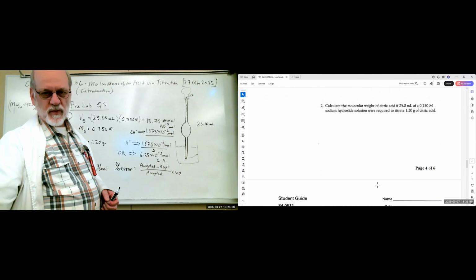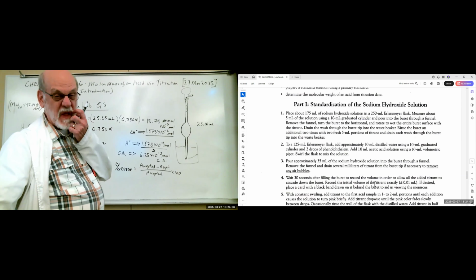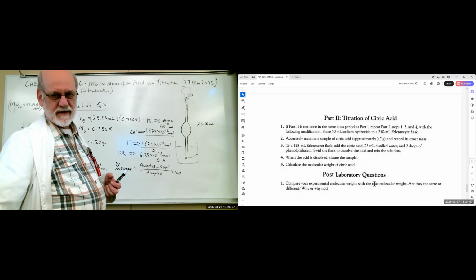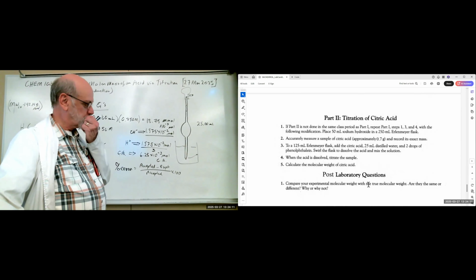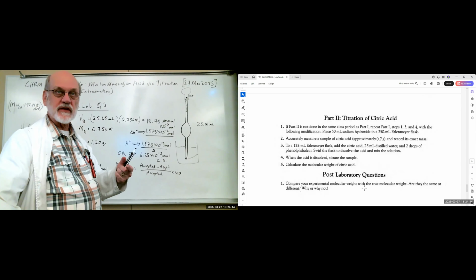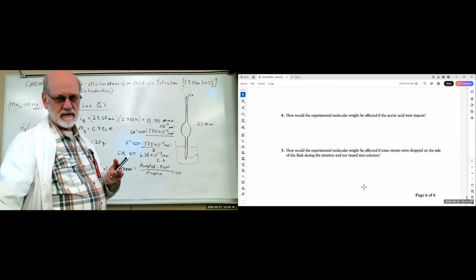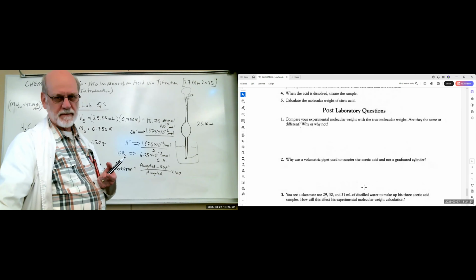Let's see. I think that's all the pre-lab questions. Yep. Okay. So we have two procedures. One, we're going to standardize the base. And the second one, we're going to titrate citric acid. And there are your post-lab questions. We got, let me see, 5 of them.